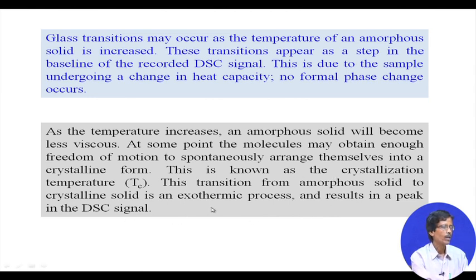But for materials of high importance, like rubber-like materials or polymer-like samples, the crystallinity is important. So, the transition from amorphous to crystalline solid is a corresponding exothermic process.